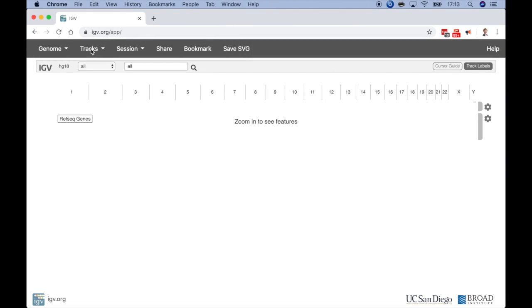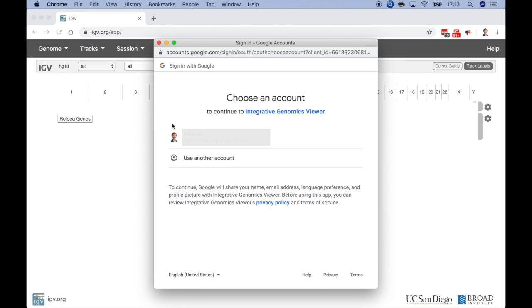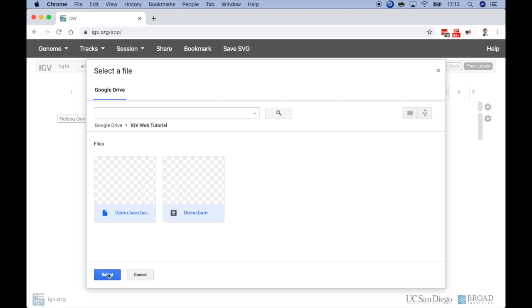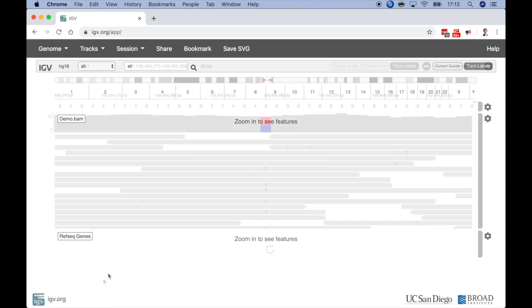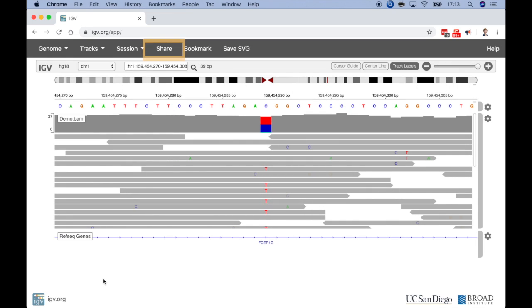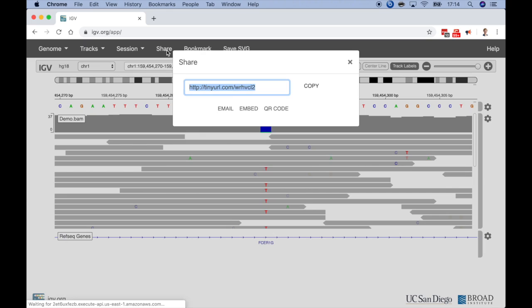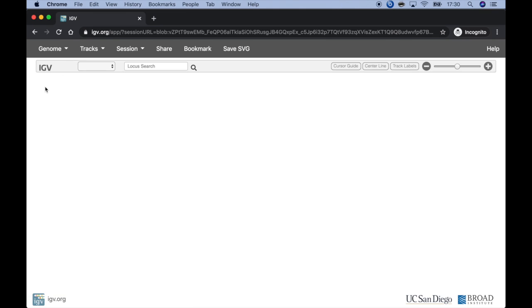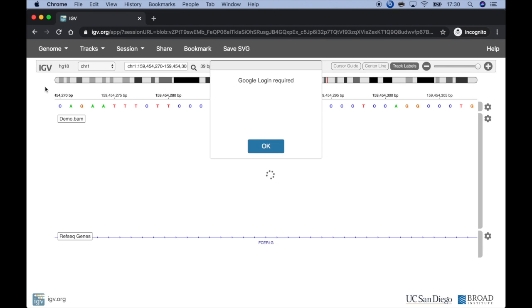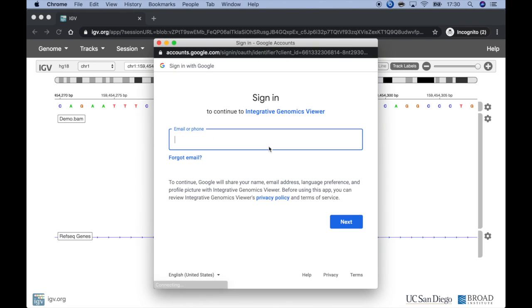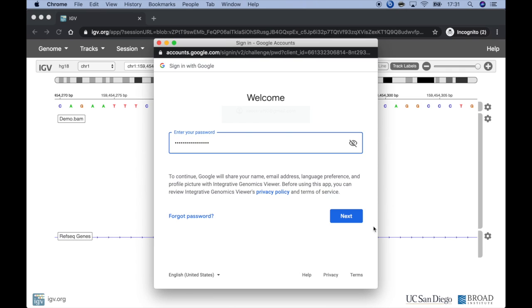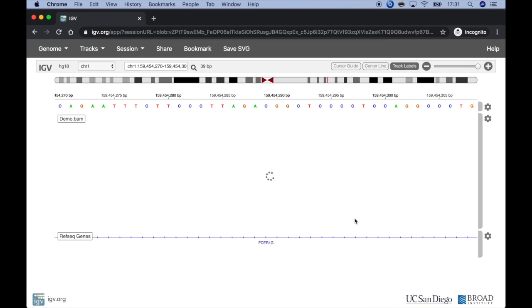Now, in IGV Web, instead of loading the files from Dropbox, I'll load them from Google Drive. Now I'll navigate to the view I want to share with Kate. And just like in the previous example, I'll copy the data view URL and send it to her. This time, however, when she enters the URL in her browser, she'll be prompted to provide her Google credentials. And then she'll be able to see and interact with the data view.